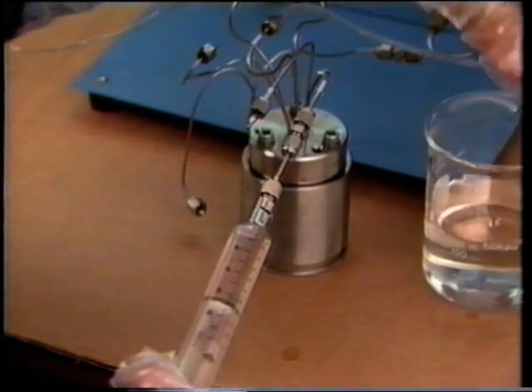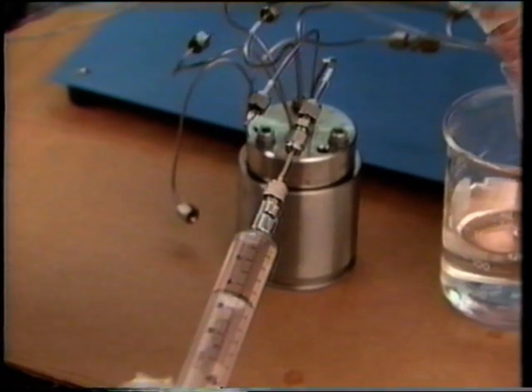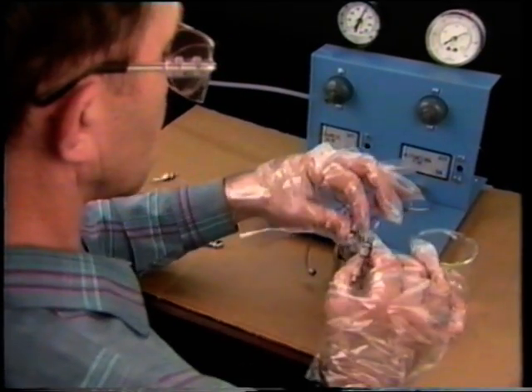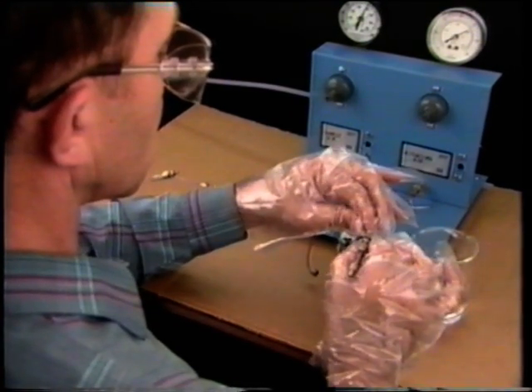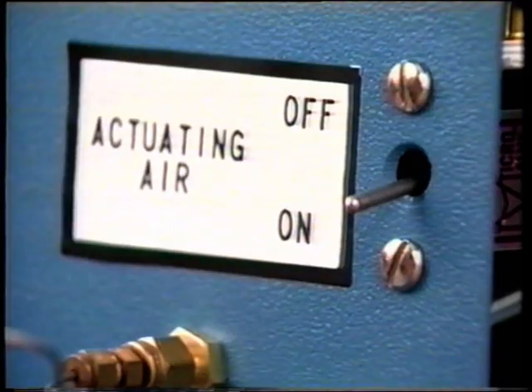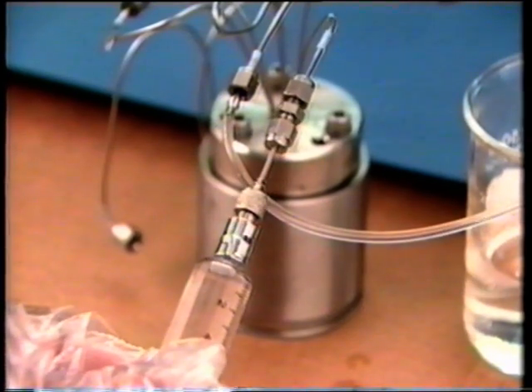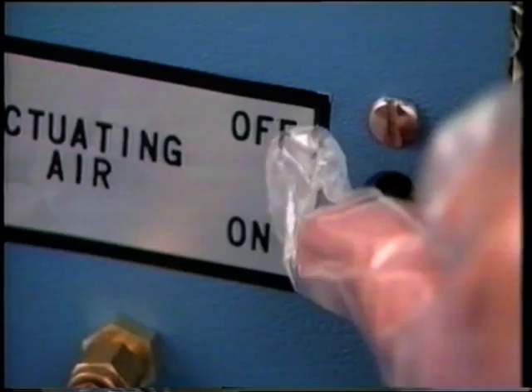Now, use the syringe to force fluid through the passage between ports 1 and 2. Remove the tubing from port 2 and place it on port 6. Leave the other end of the tubing in the fluid. Switch the valve by applying air pressure. Use the syringe to force fluid between port 1 and port 6. Now remove the air pressure.